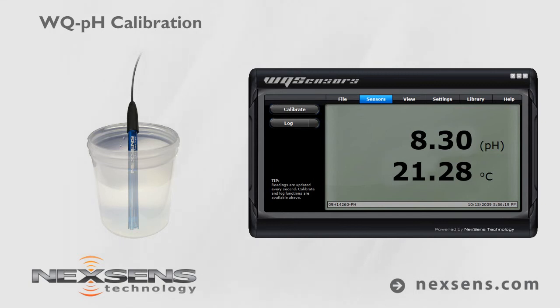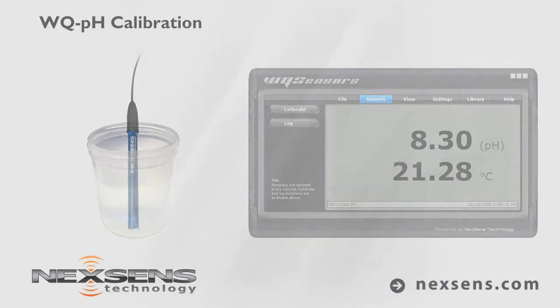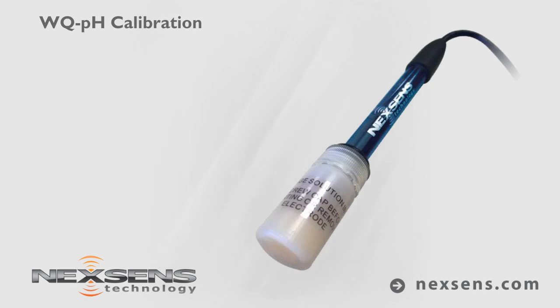Press the log button to store the readings with a date and time stamp. Quality data collection requires frequent calibration. For best results, calibrate before each use.